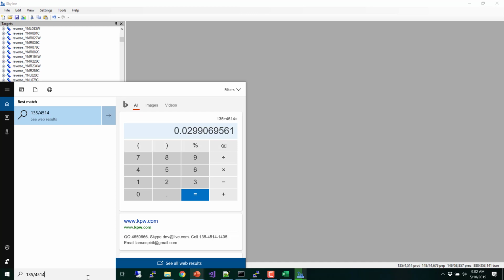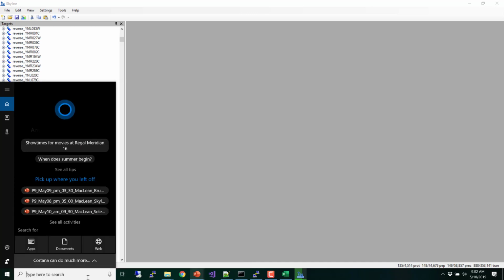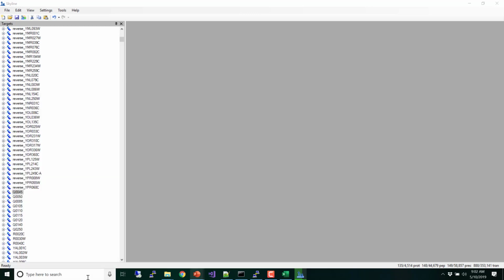Whereas in the reverse case, whenever I have a false discovery, I'm probably hitting a new protein. So I think the true protein false discovery rate is probably something like a third of that. So it's pretty close to 1% protein false discovery rate. That's my belief. But anyway, we probably can live with a 3% false discovery rate also.